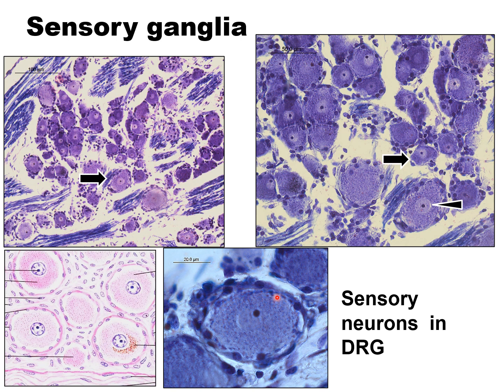Here you can see the satellite cells. These are special types of cells surrounding the dorsal root ganglia or the autonomic ganglia also. In trigeminal ganglia also, the similar kind of neurons are visible.